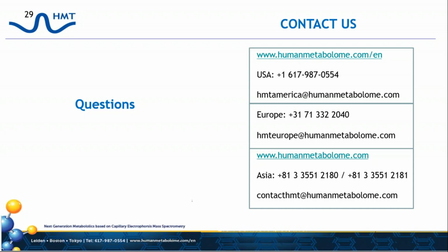How long does it take to get results? Well, we typically tell everyone 4 to 6 weeks. It just depends on the size of the study. Usually the deliverable at that time will be an Excel file with all your raw data in it, and a PDF, which would be a short, complete analysis of your study.